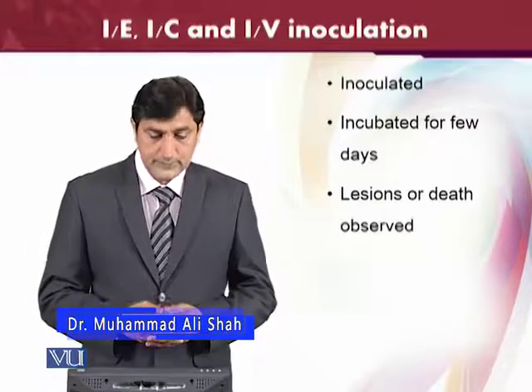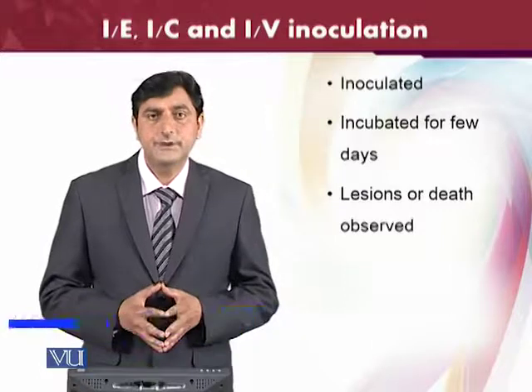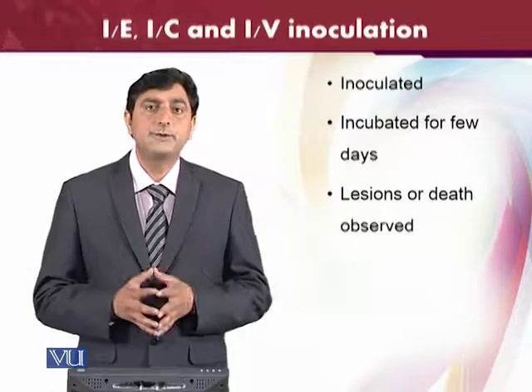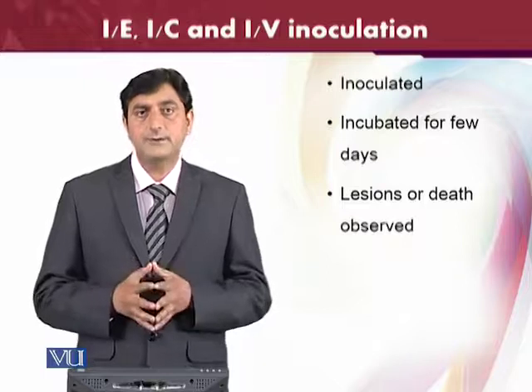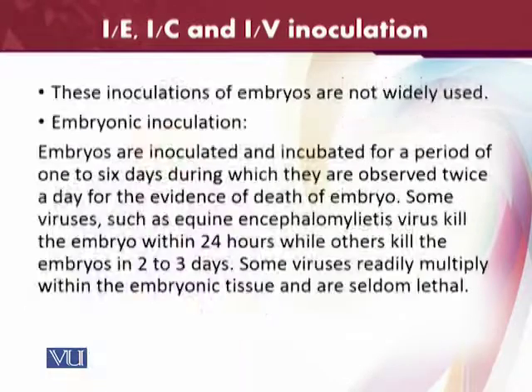So, we inoculate intraembryonically or intracranially and then incubate for a few days and see the results, whether the viruses have been grown or not. Two types of lesions we can see, or death is observed, and in this way we can see that viruses are inoculated and can be isolated, specifically from dead embryonated eggs. These inoculations are not widely used, as we have already studied. They are very rarely used.